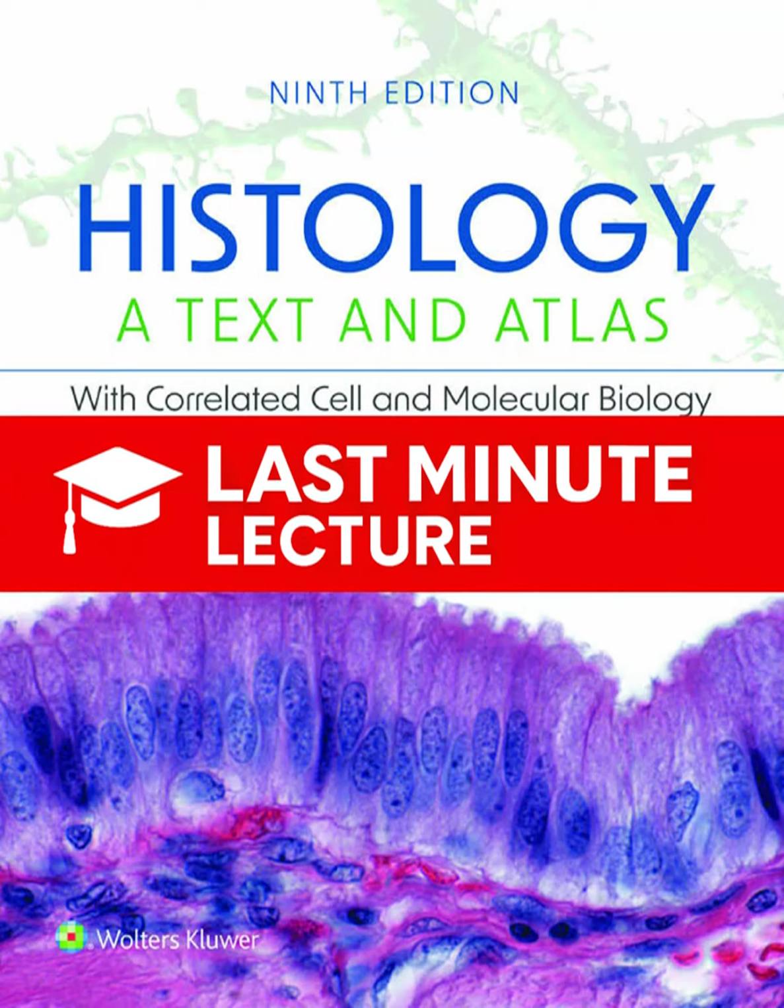It requires supreme fixation and embedding. You start with glutaraldehyde for the proteins, but then you immediately follow that with osmium tetroxide. The osmium is crucial because it binds to lipids, stabilizing membranes, and it imparts high electron density, which you need for contrast. And the samples have to be tiny. Exceptionally small, maybe 1 millimeter cubed, and embedded in a hard epoxy resin.